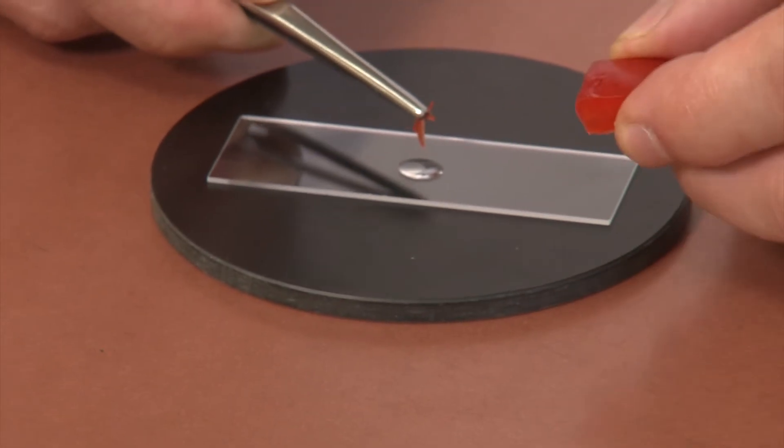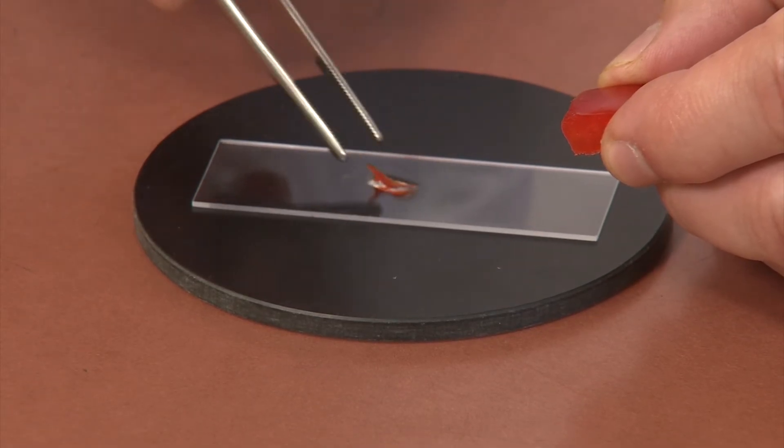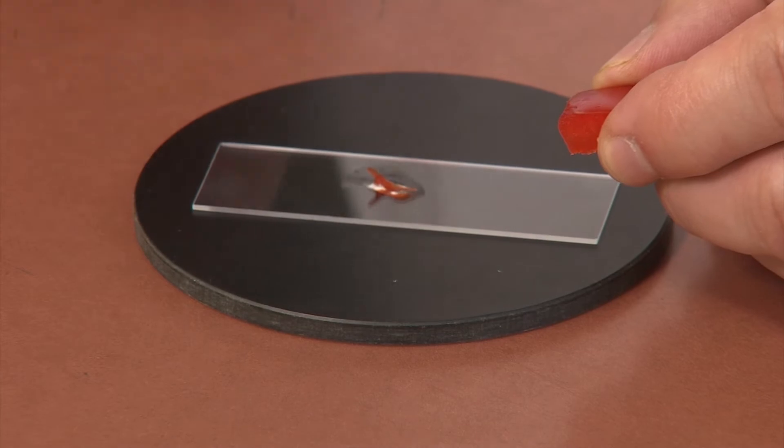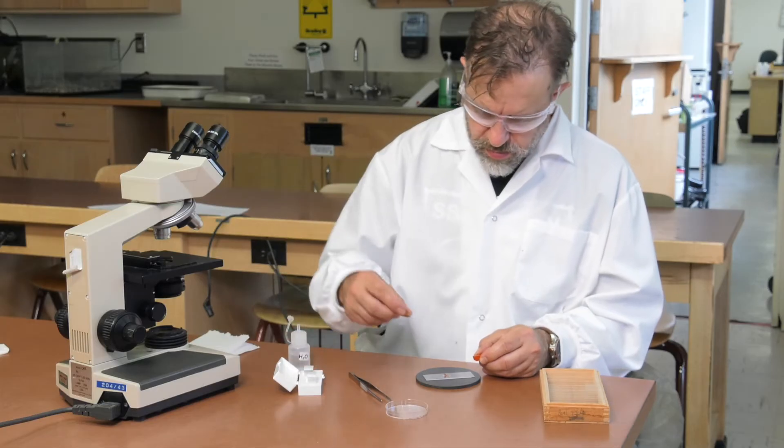Place the skin in the drop of water on your slide with the outer layer facing up. Be sure not to flip your peel so that pulp is lying on top of the peel. Apply a cover slip.